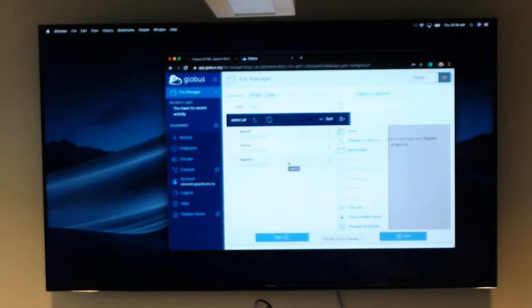From Appion Part 1, your test accounts are still active, so if you still wanted to do some testing, that is useful. We'll be making use of that account today. So if you go to emgweb.nyspc.org, you can log in with the username test, and the password Appion 2019. It's also on the board over there.